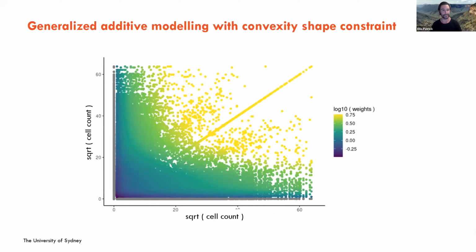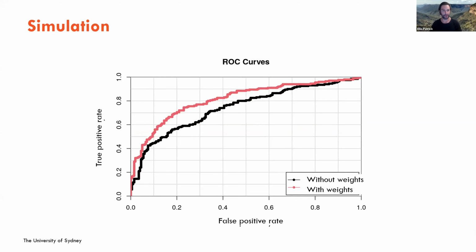Because we're testing things at least between pairs of cell types, these aren't just simple scatter plots like we saw there, they're bivariate, and we fit kind of weight curves in this two-dimensional space. And so we've been having a lot of success with this approach.